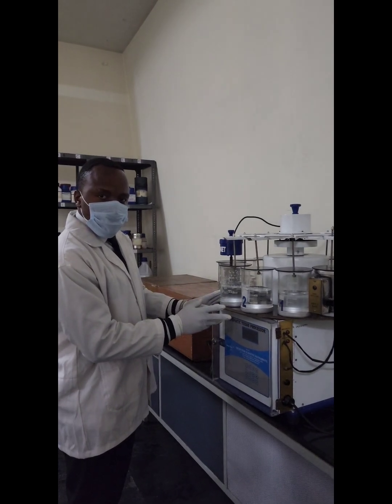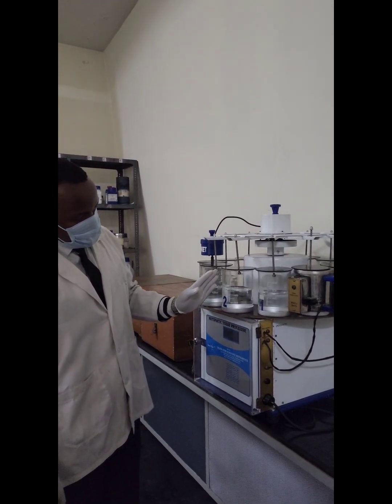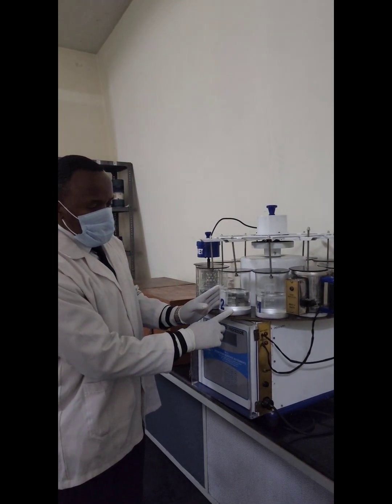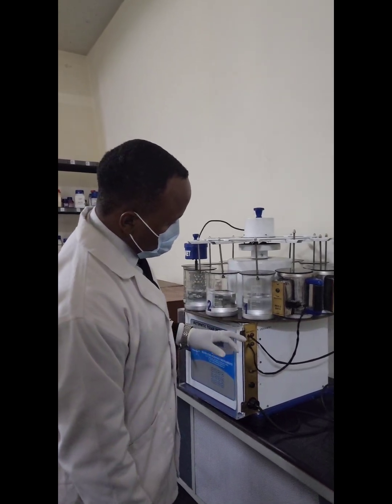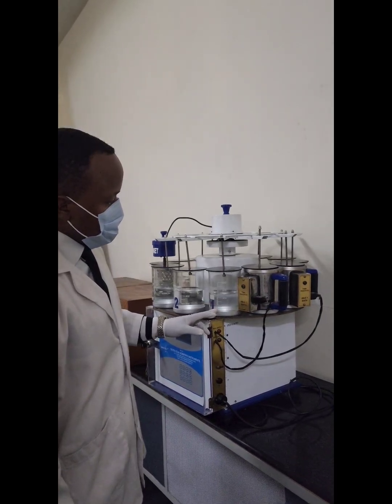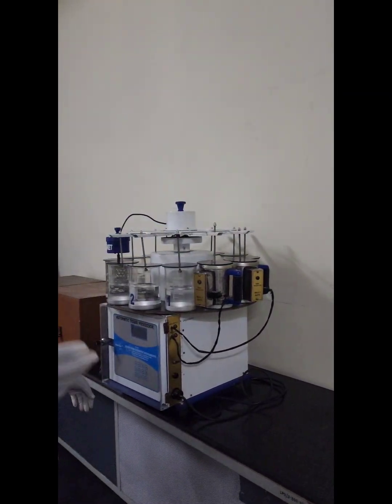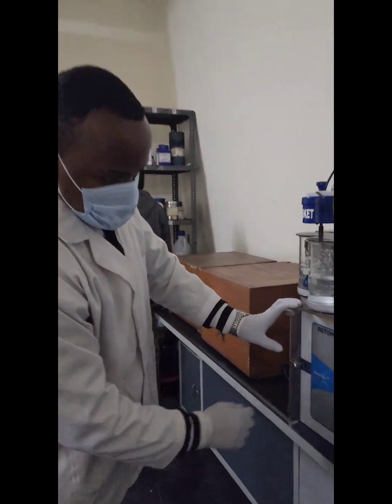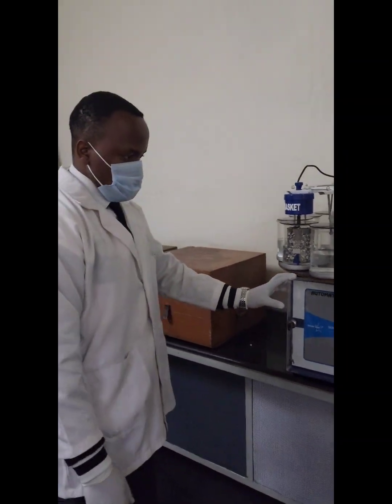Our next step would be tissue processing, and for today's video we'll be using an automated tissue processor. This machine allows us to give it a detailed set of instructions which it will follow and will help us in the whole process of tissue processing. The tissue processing steps include dehydration, whereby alcohol will be used, clearing, whereby xylene will be used, and impregnation, whereby paraffin wax or other mediums can be used.